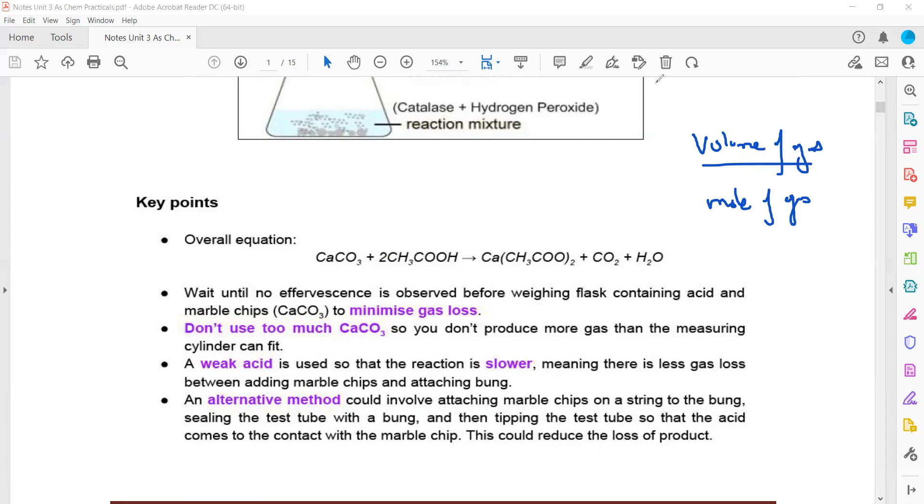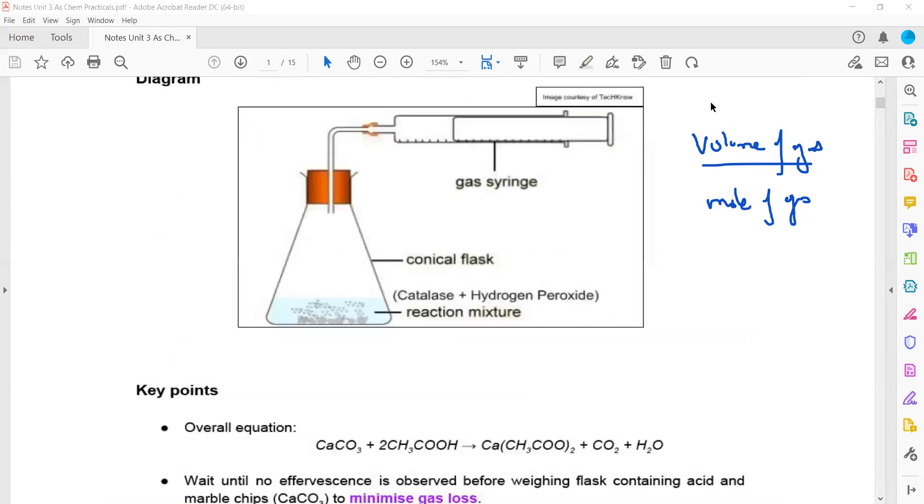The volume of gas is measured using the gas syringe. To get the moles, use the formula: moles equals mass in grams divided by molar mass. We won't directly get the moles of gas, so first we'll get the moles of the limiting reagent.